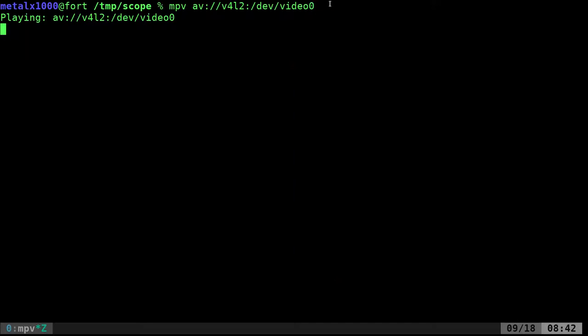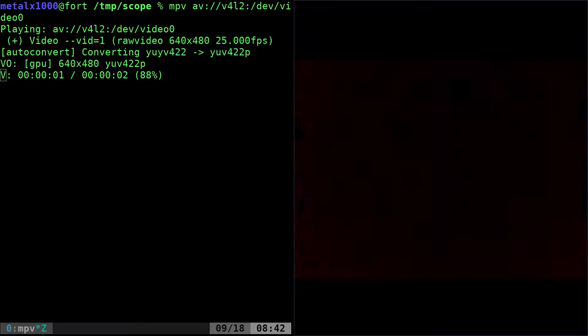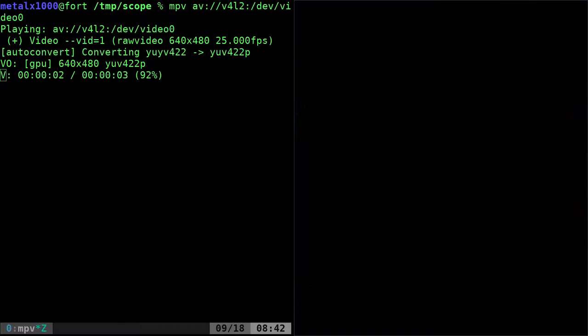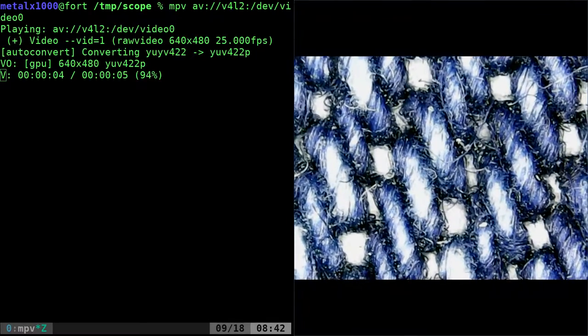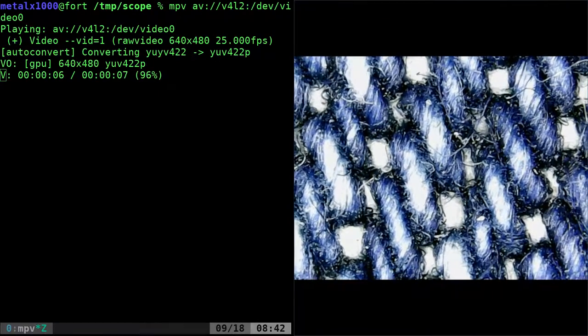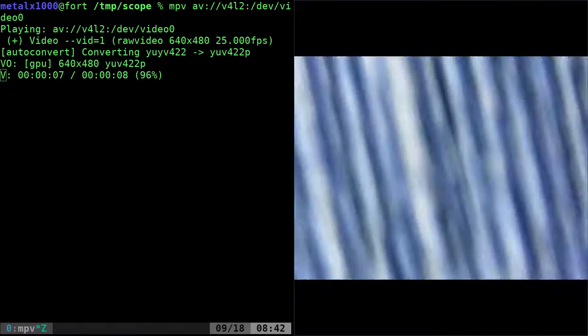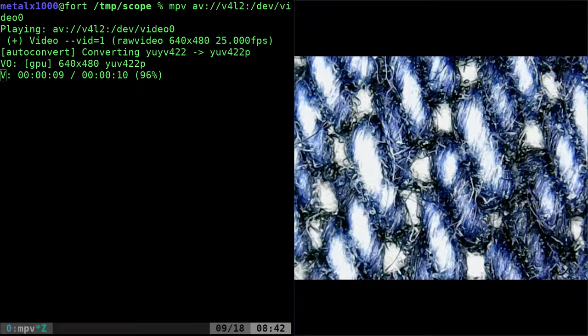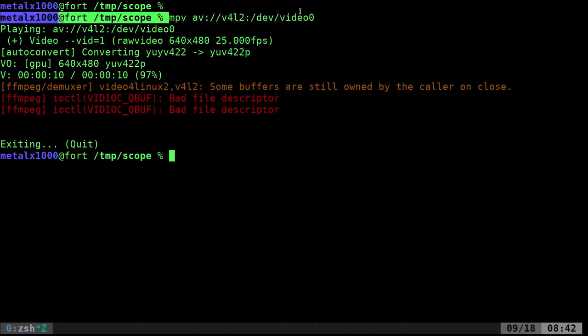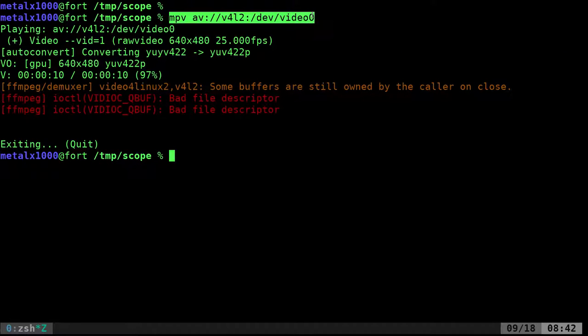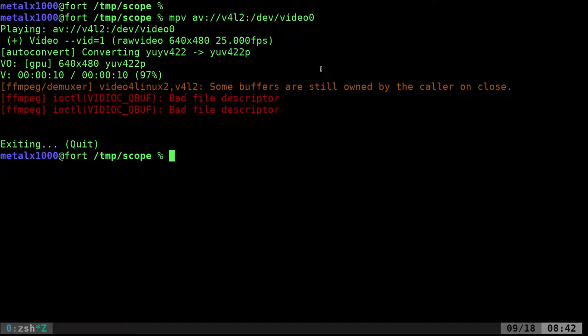I'll hit enter and there we go. Don't worry we won't be looking up my nose again today. Here are my blue jeans that I'm wearing, these are the threads. That's simple enough but that's a lot to remember. Of course it's in your history so it's easy to search through your bash or whatever shell you use history.